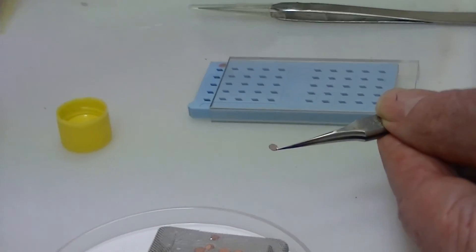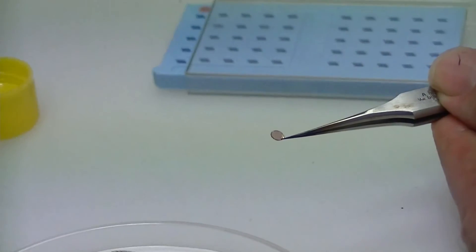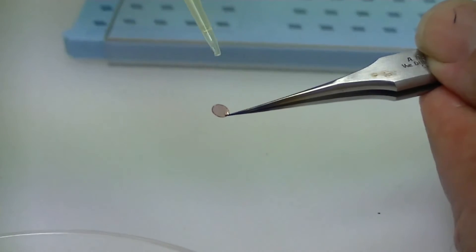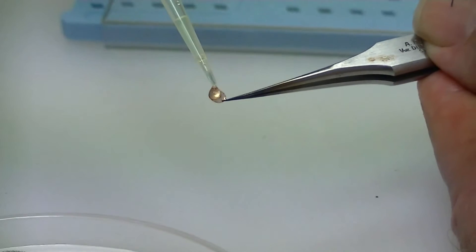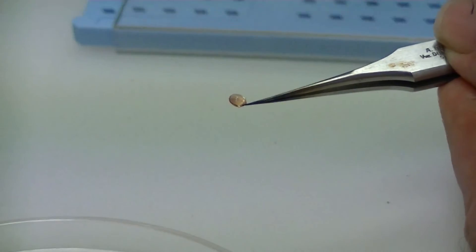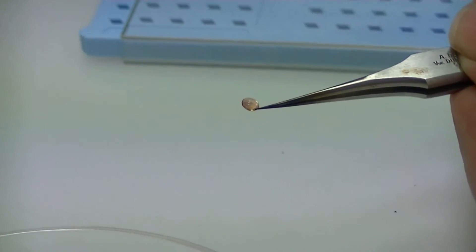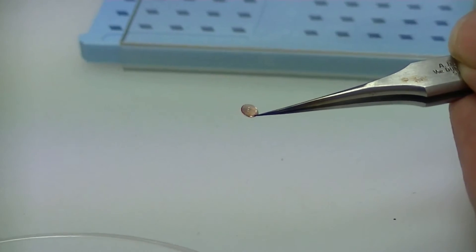So we then put some stain on the grid, leave it for 10 seconds, no longer, and then drain that off.